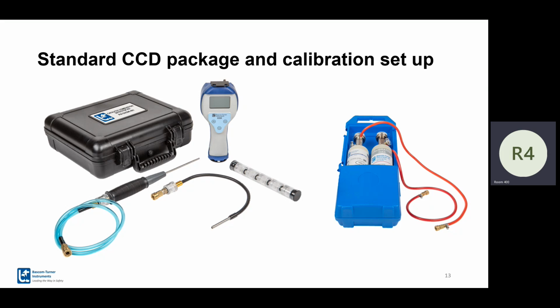Yes, ma'am. What about drift? What have you seen with drift, for the people that have used it? I've not had it fail to drift. Now, understand that I'm not using this to do method 21. I'm doing this to do comparative monitoring to basically double check on my technicians, but I've gone through the calibration, and when I calibrate with 0, 500, 2,000, and 10,000, and when I say I calibrate, I bump test the machine, and the machine is spot on. It's closer and more accurate than a 2020 in my experience.